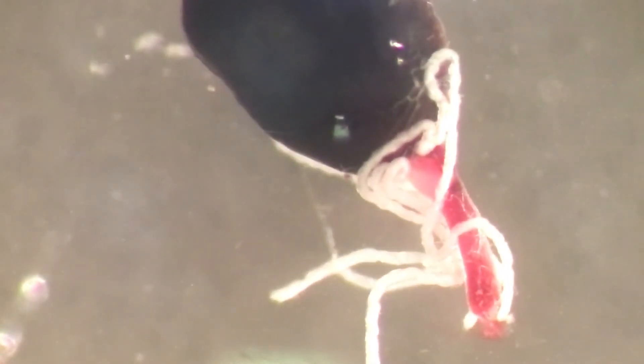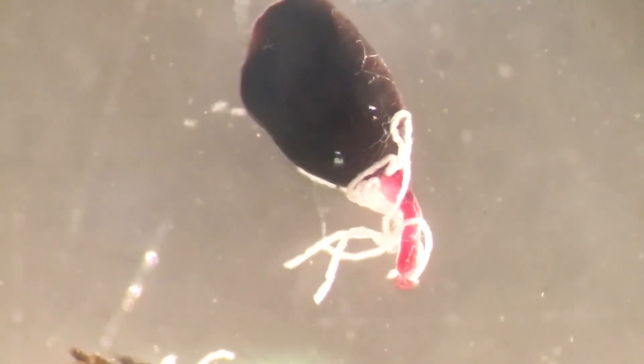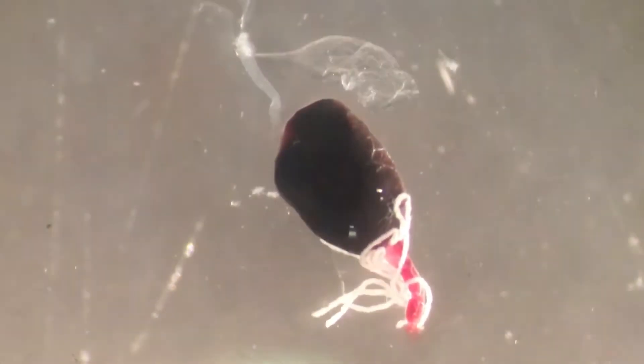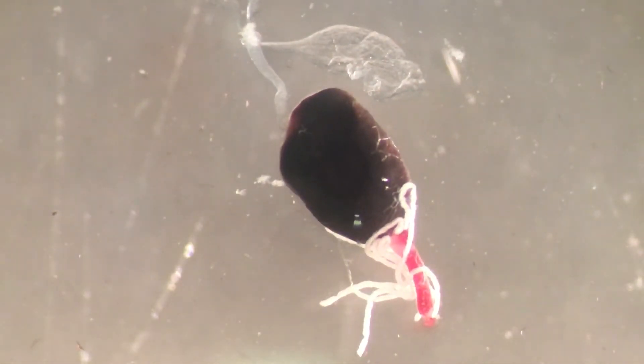The Malpighian tubules are responsible for removing toxins and detoxifying toxic molecules in the insect. That's peristalsis at the posterior end of the midgut. So those are the Malpighian tubules - like insect kidneys, they have a detoxifying job. That's the midgut. Now let's see if we can get some nice salivary glands.